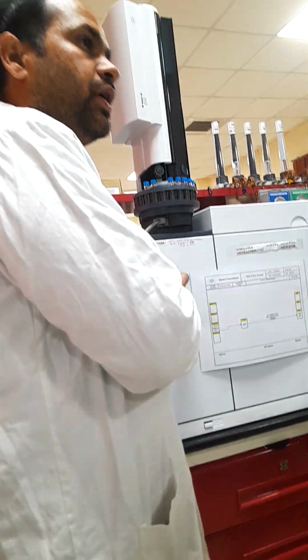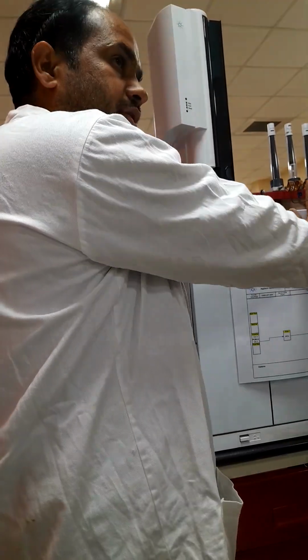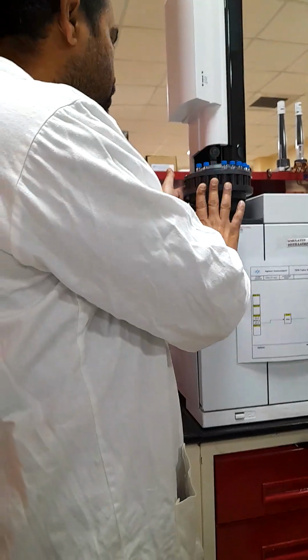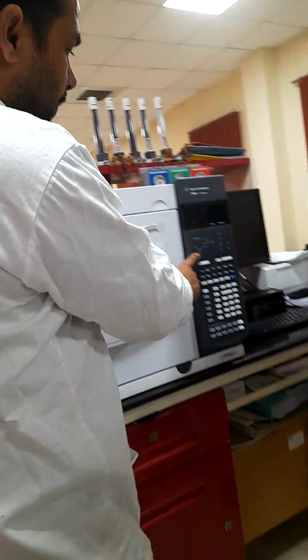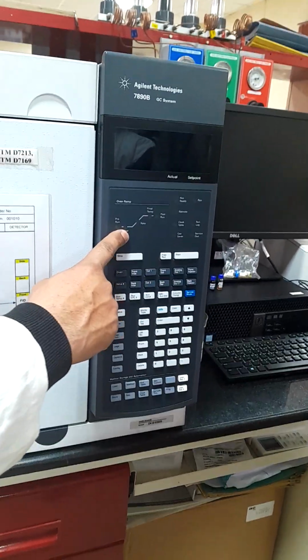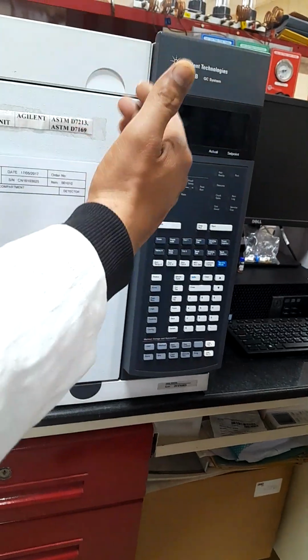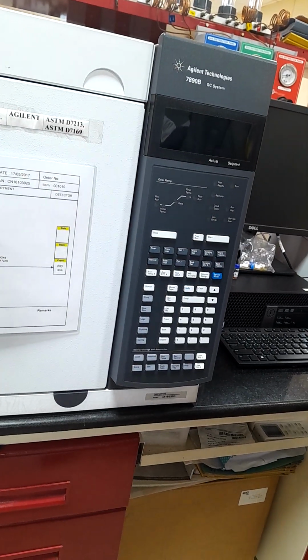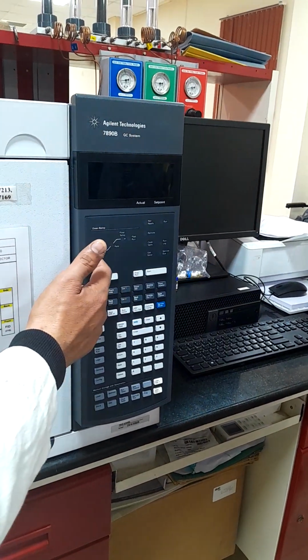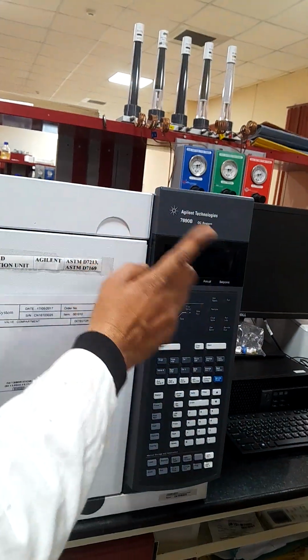Programming of temperature. In the temperature program, initially it is 40, and 375 is the stable final temperature. I will let you know why 375. Similarly, there is a ramping shown. So what is ramping? Initially the temperature is 100, and it will rise at 15 degrees per minute. This is the rate at which the inlet and oven will rise in temperature. So by rising, the final temperature will come to the detector temperature, this 375.